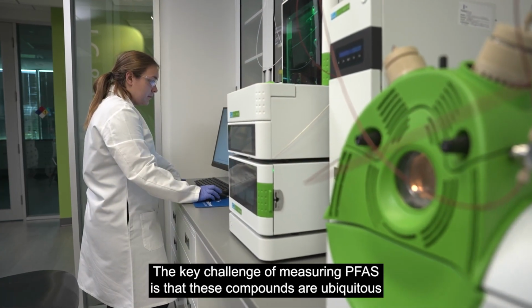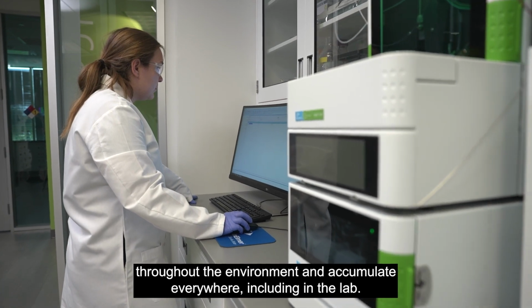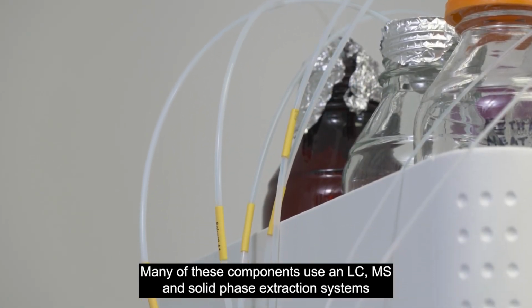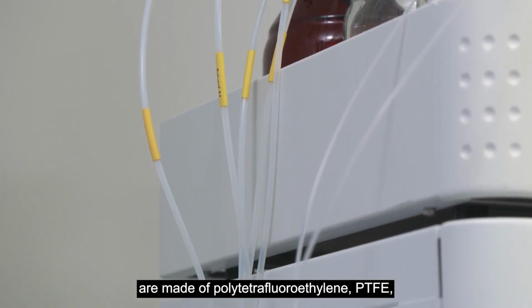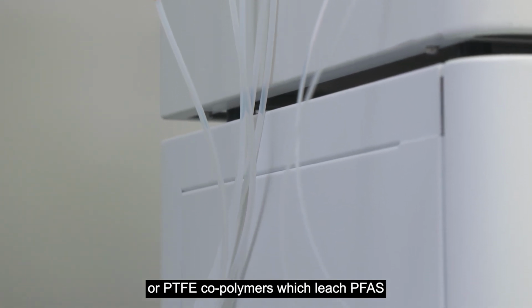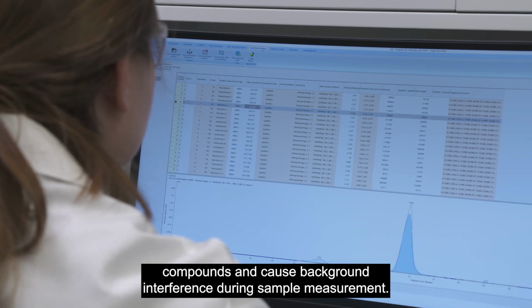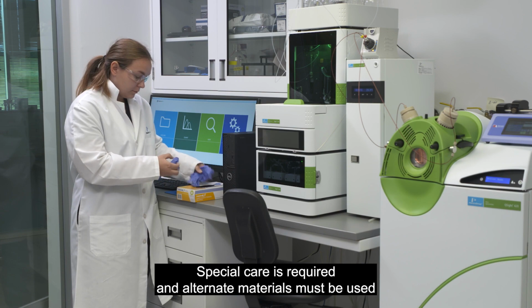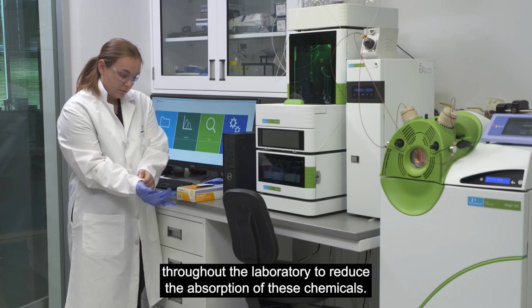The key challenge of measuring PFAS is that these compounds are ubiquitous throughout the environment and accumulate everywhere, including in the lab. Many of these components used in LC, MS, and solid phase extraction systems are made of polytetrafluoroethylene, PTFE, or PTFE copolymers, which leach PFAS compounds and cause background interference during sample measurement. Special care is required, and alternate materials must be used throughout the laboratory to reduce the absorption of these chemicals.